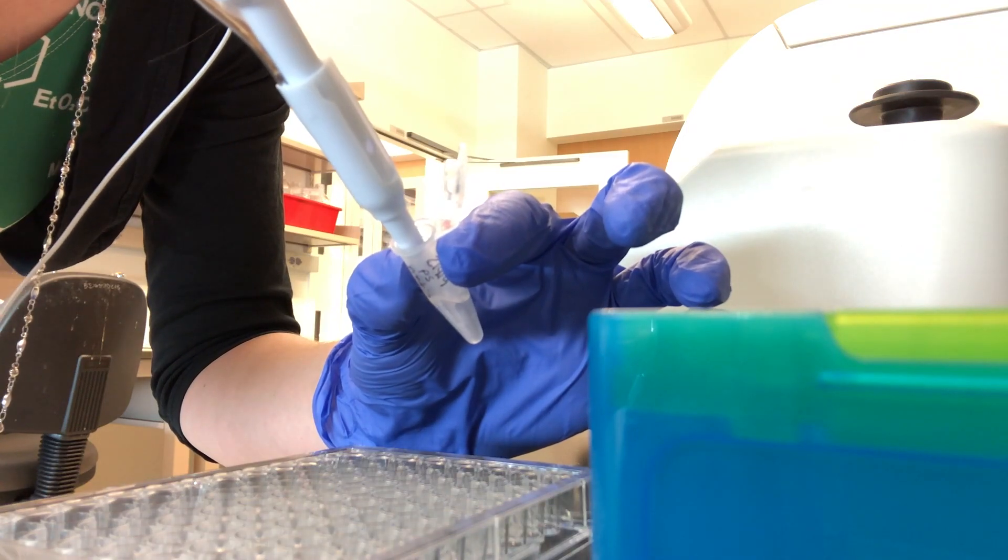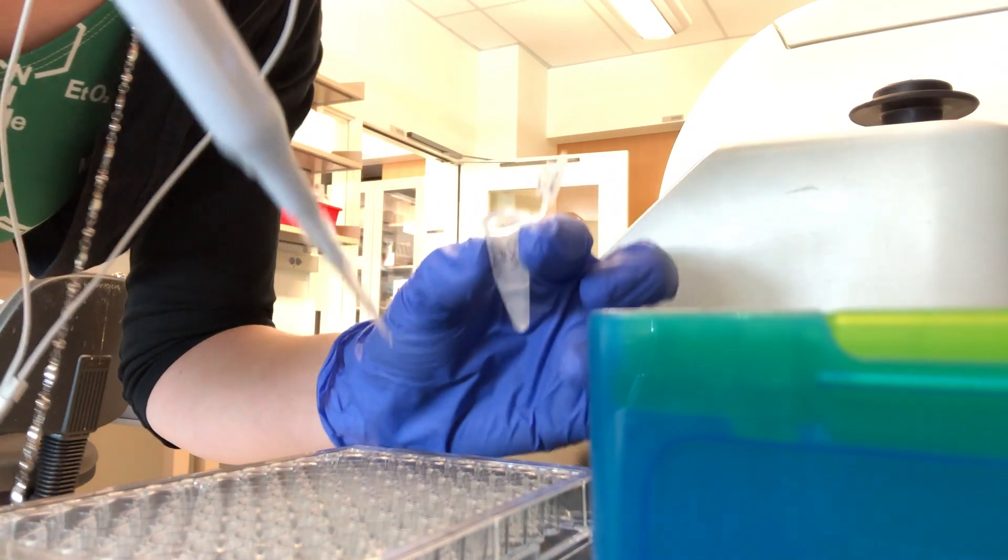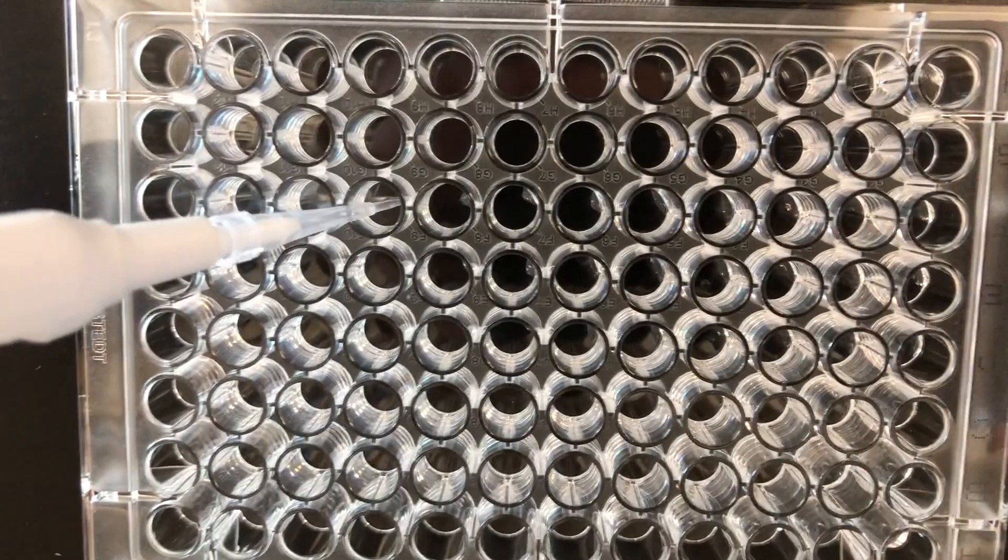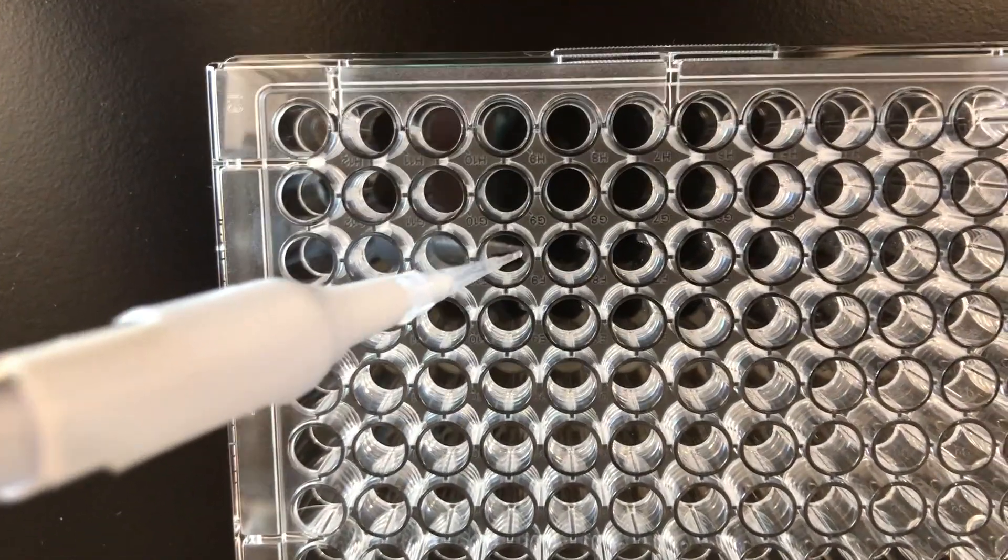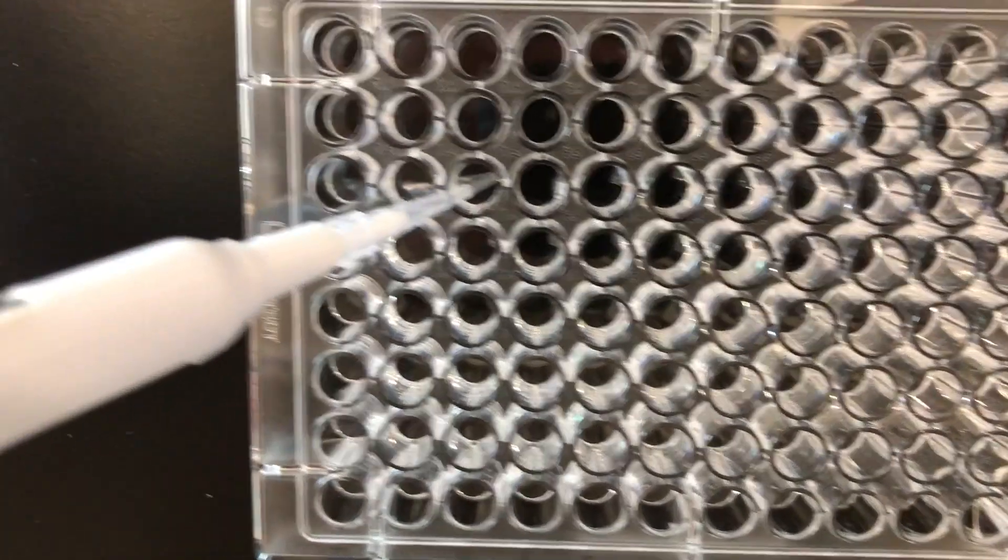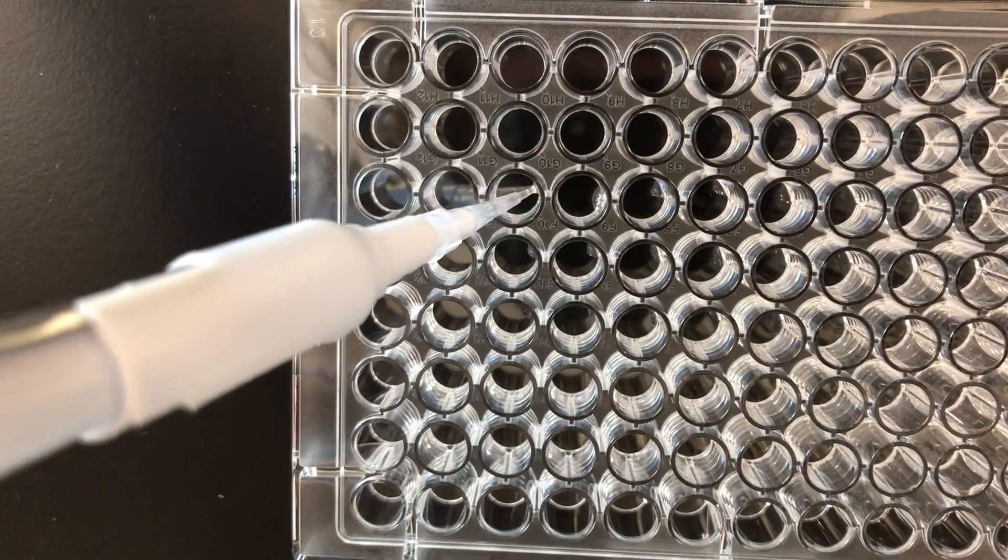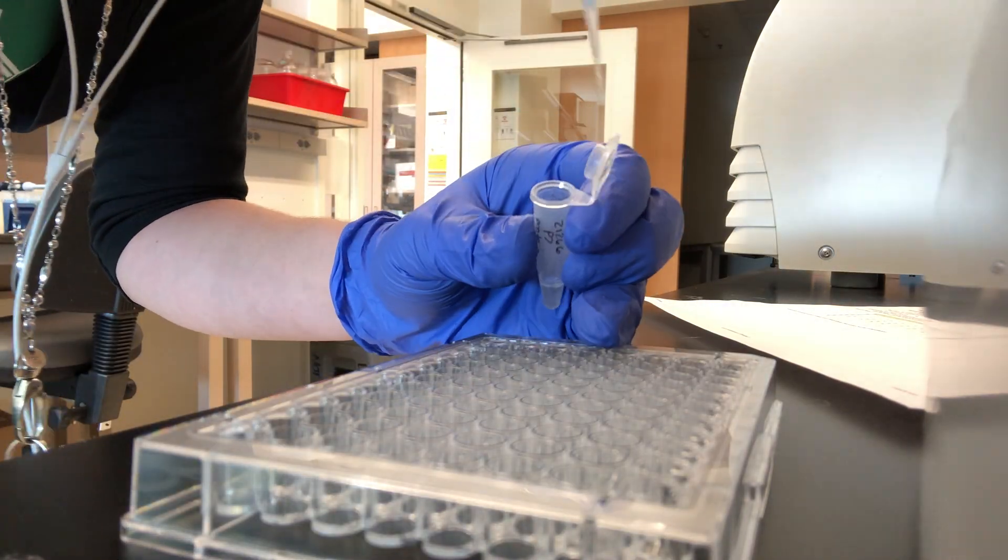Then I use a pipette to transfer a tiny amount of the protein solution into a well of a 96-well plate. As you can see, it's a very tiny amount, not much bigger than the period at the end of a sentence. I repeat that for each sample, doing each one in duplicate, meaning doing the same sample twice so that I can measure my accuracy.